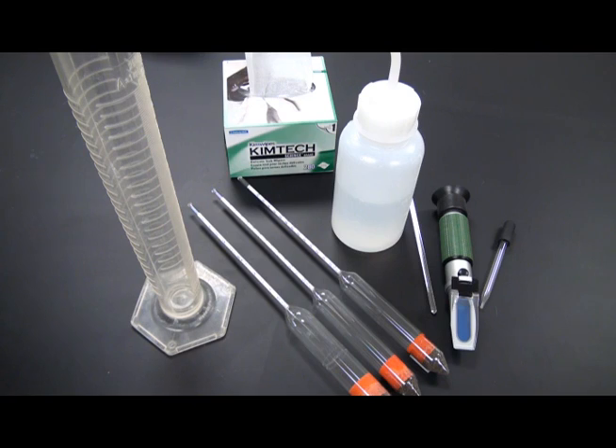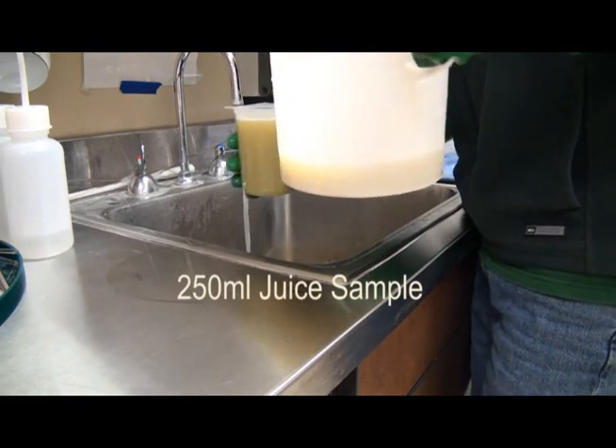The equipment needed to test brix in juice with a hydrometer includes a hydrometer, a 250 ml graduated cylinder, and a 150 to 200 ml juice sample.